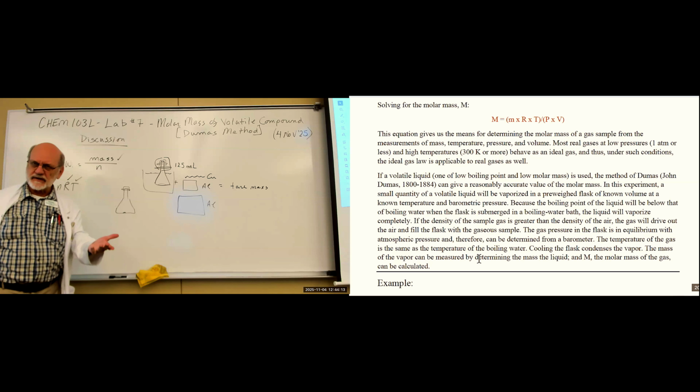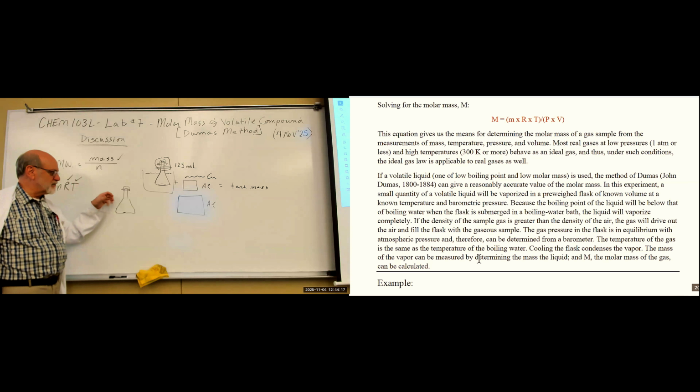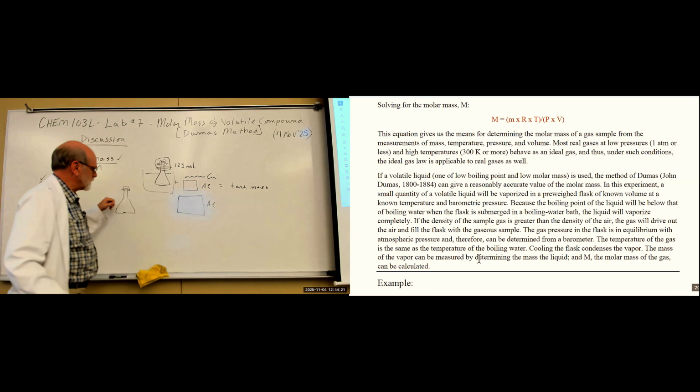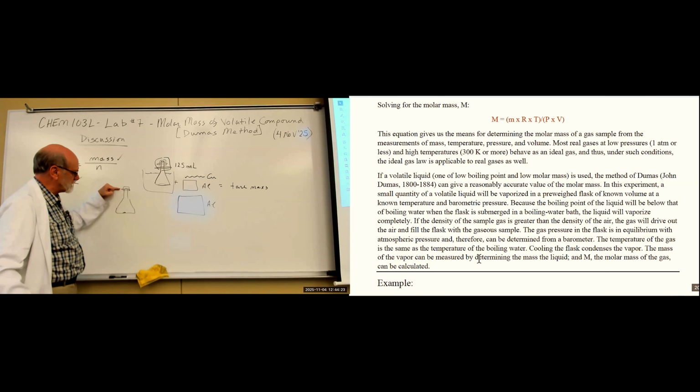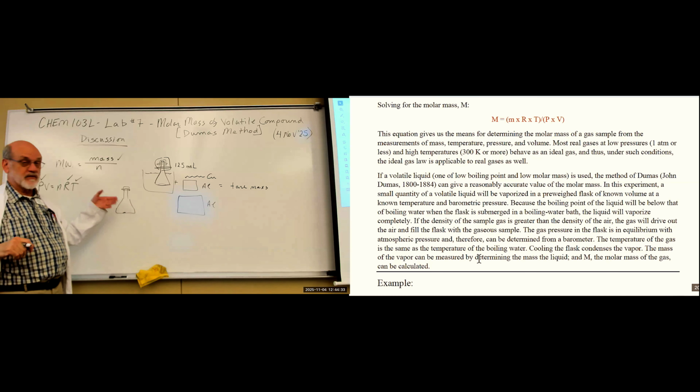Now we have two possibilities. We have the mass of the container here. So if we fill it up with water all the way to the top, where we think the aluminum was stopping the gas, and weigh it again, then we can get the mass of the water.